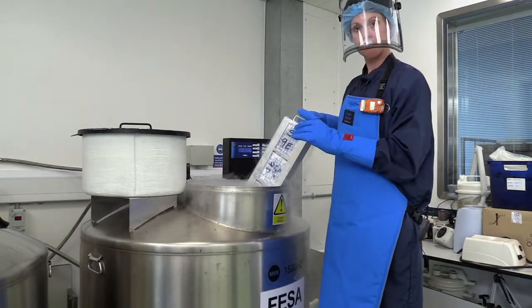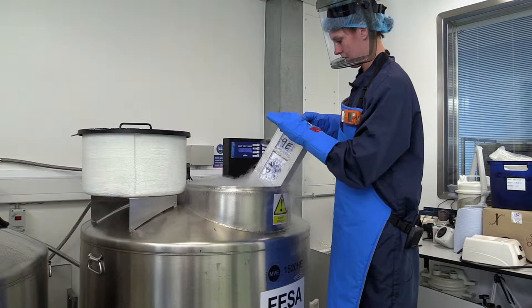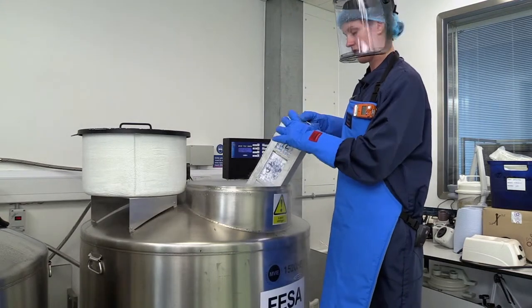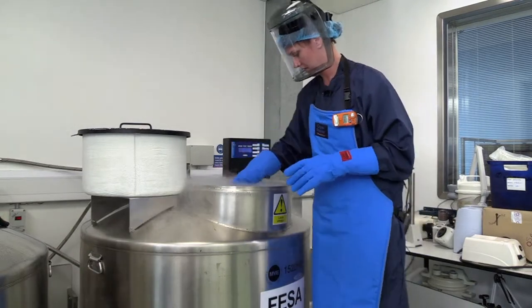In here we've got little tubes that have a small amount of sperm in them, and they fit in these boxes. We can fit 100 samples in each box, 5 boxes in each rack. And just pop that back in before it gets too warm.